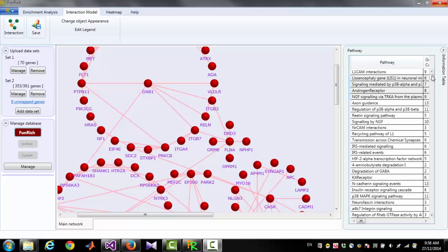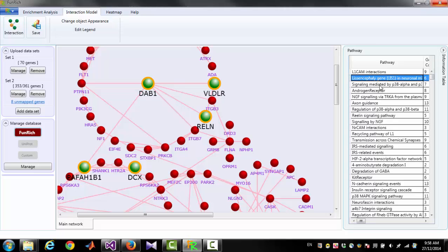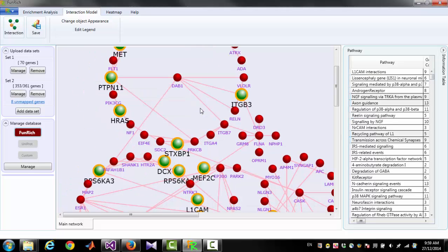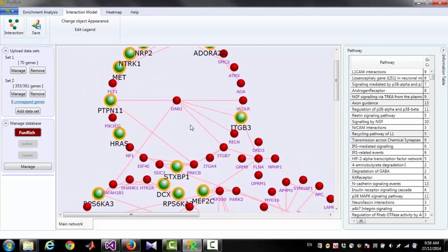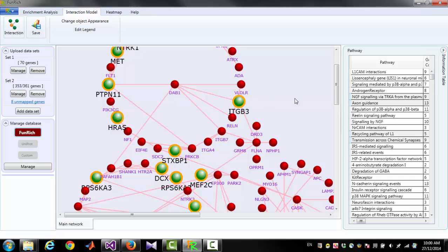On the right side of the diagram you will find the list of pathways. Selecting one or more pathways in this list will highlight the associated genes. You can remove highlights from the diagram by right-clicking on the empty space and clicking 'Clear Highlights'.